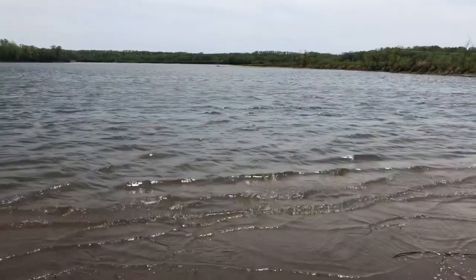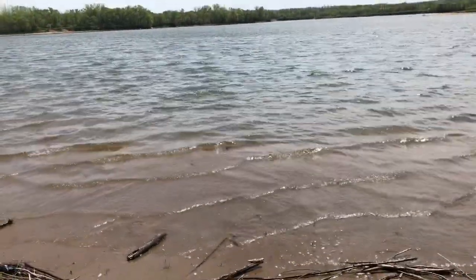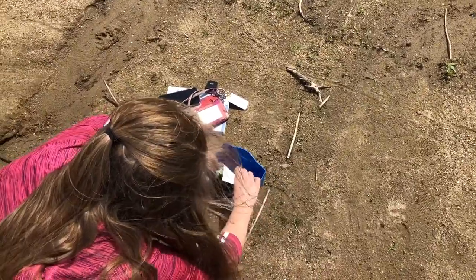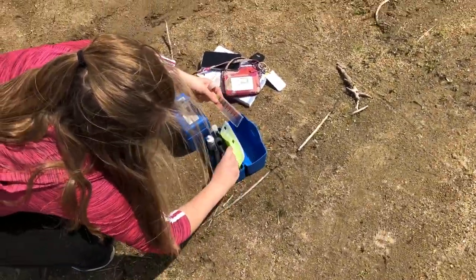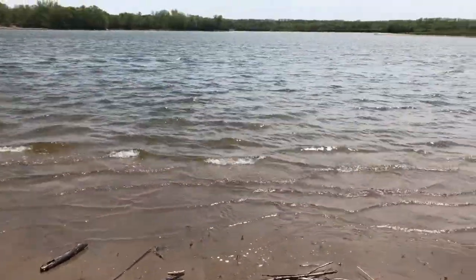We're here at the reservoir of the river so it's all river water, but it's not directly accessible because it's kind of hard to get to. We have phosphorus kits and pH kits and we're going to test the water.